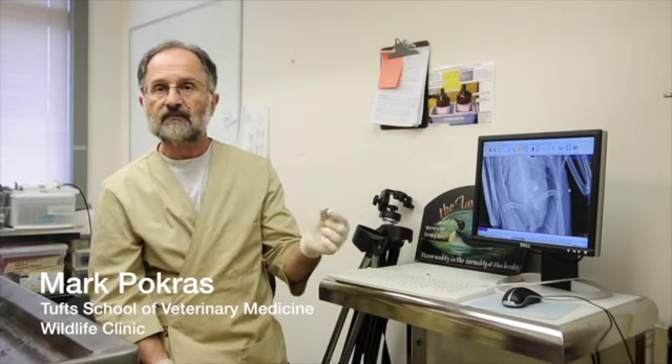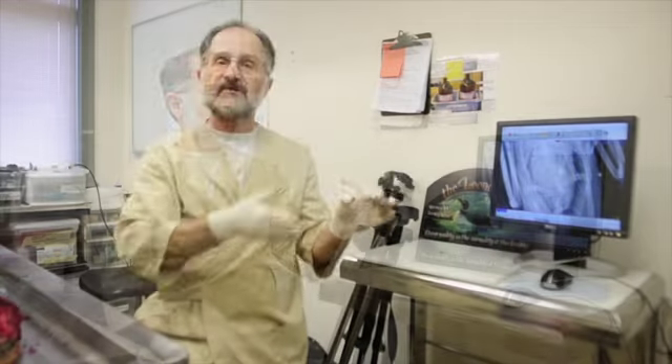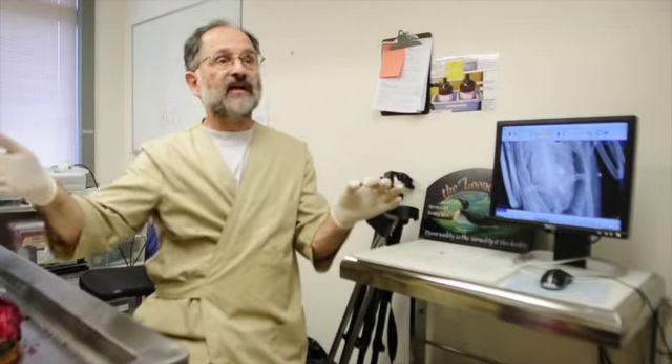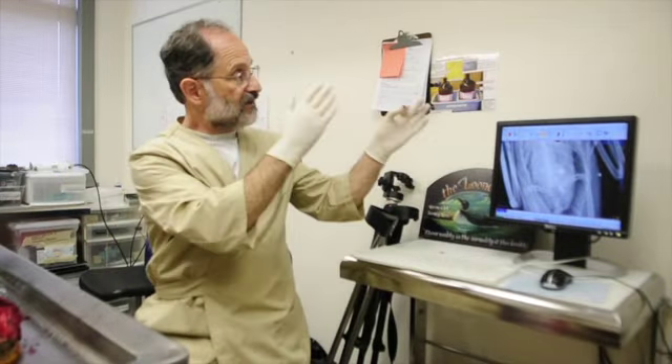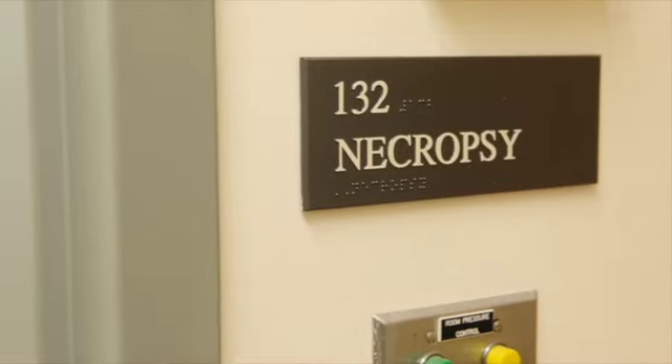We found this small lead jig head. It's a sequence of things building the case to show that this animal was killed by this object. We have to go in a sequence here to prove the case.